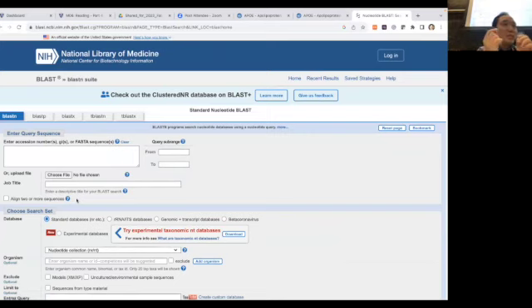But the default mode of BLAST is you provide 1 query sequence and search against the full data set. That's not what I want. I want to provide 2 sequences, ApoE3 and ApoE4, and just align those 2. And do you see this check mark, align 2 or more sequences? So I'm going to click that.